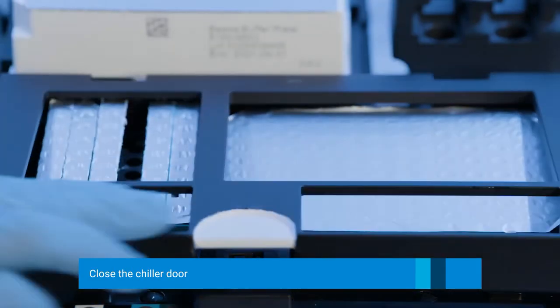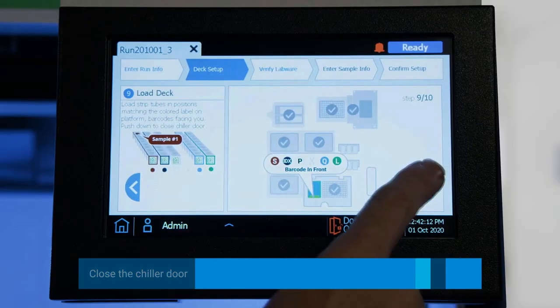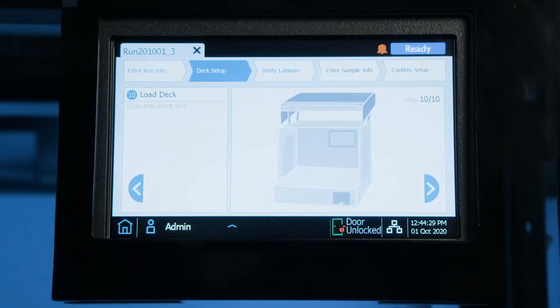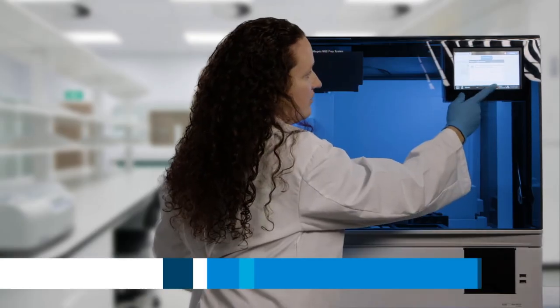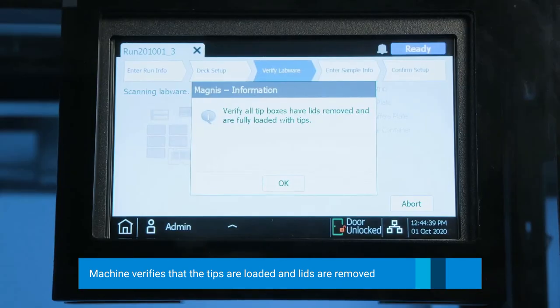We are going to push down to shut the chiller drawer. Make sure that it's shut and click Next. Now we are going to close the instrument door. Click Next to indicate that we've done that. We need to verify that all of the tip boxes have their lids removed and that they're fully loaded with tips, which they are.